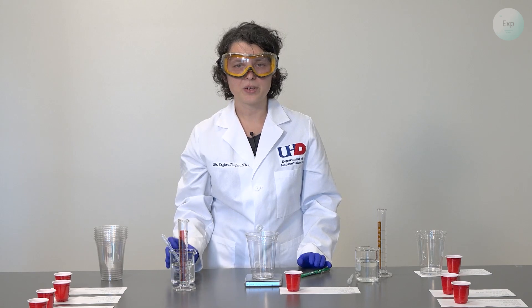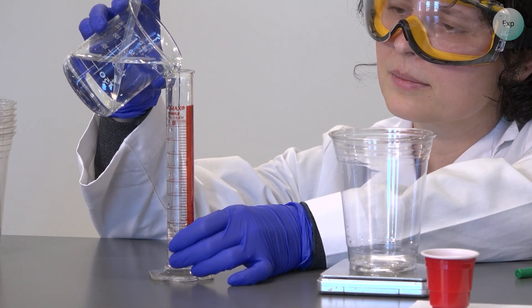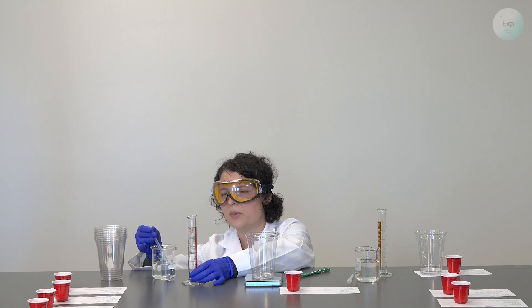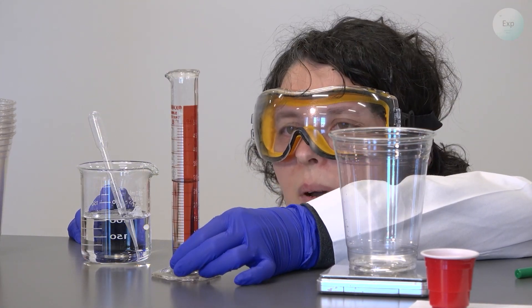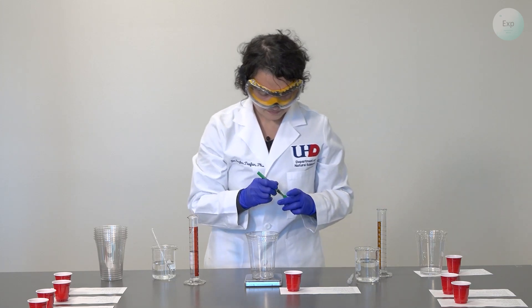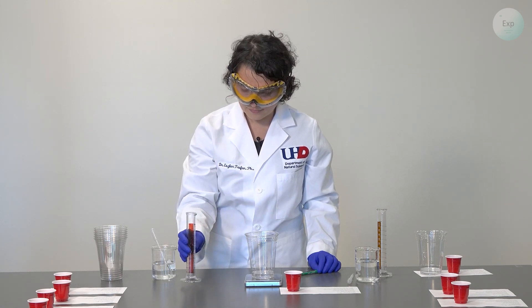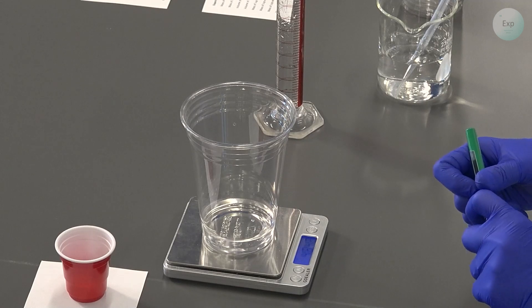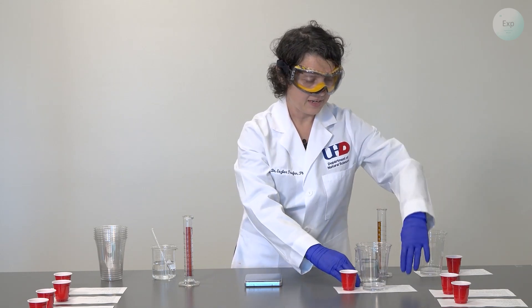On the other side, I'm going to measure 30 milliliters of water. I am just under it, so I'm going to add a little bit more. My measurement is 29.8 milliliters and I will record that. Then I transfer the water into the cup, swirl to create a homogeneous solution, place it back on the scale, and record the combined mass: 48.48 grams. I will place my cup on the second piece of paper and slide it back into position.